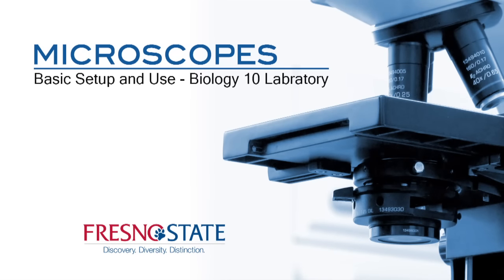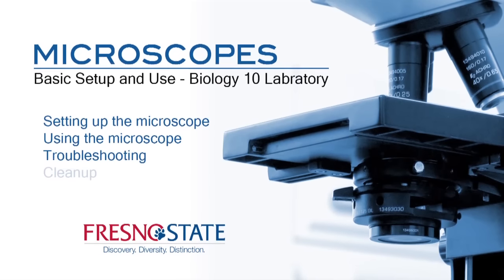This video demonstrates how to use the microscopes in the Biology 10 Laboratory. It consists of four parts: setting up the microscope, using the microscope, troubleshooting hints, and cleanup.